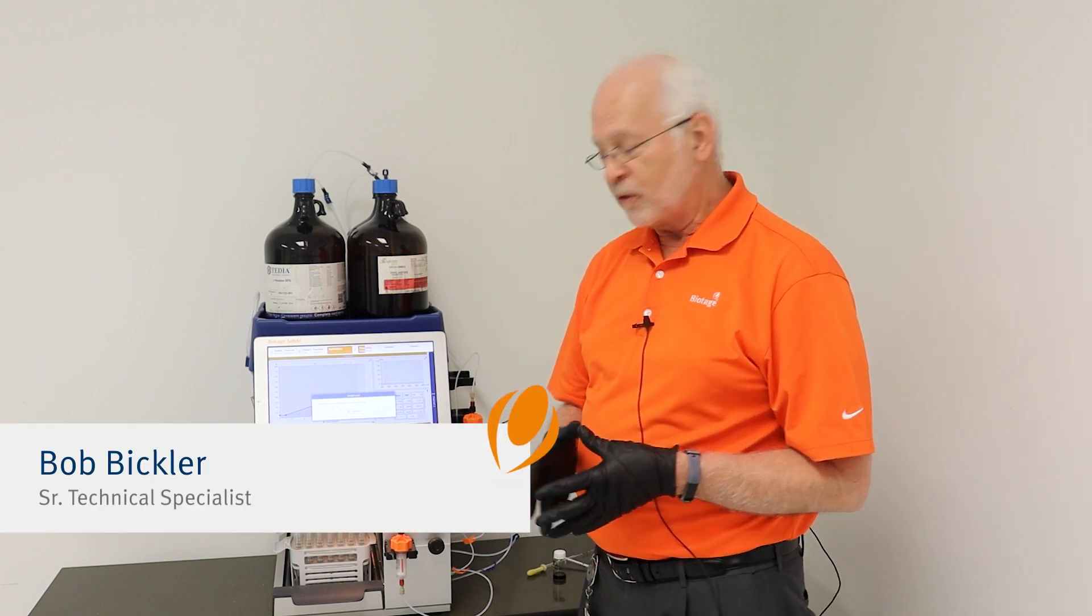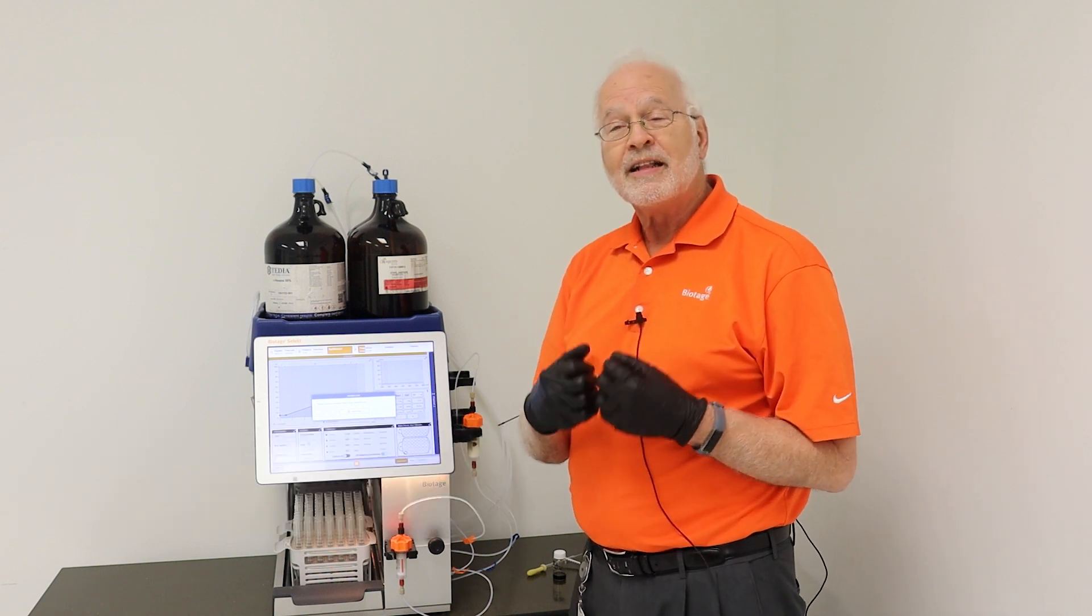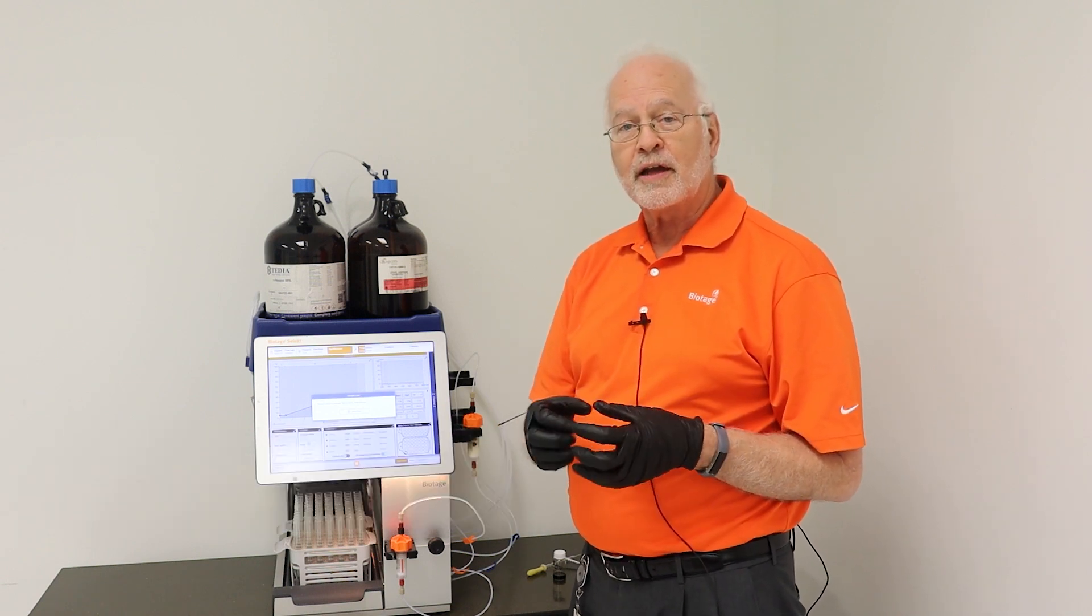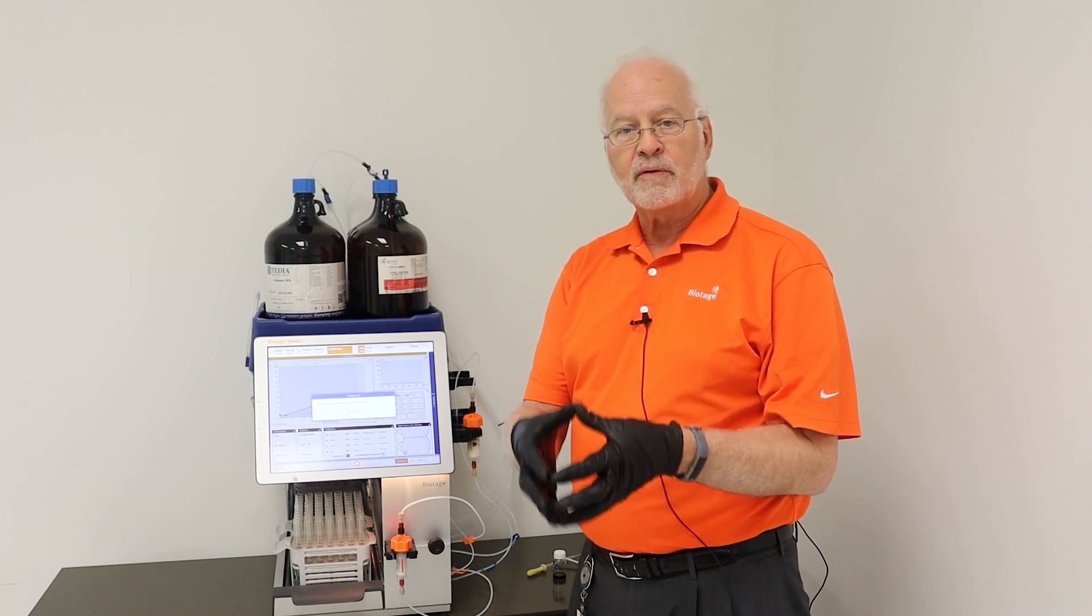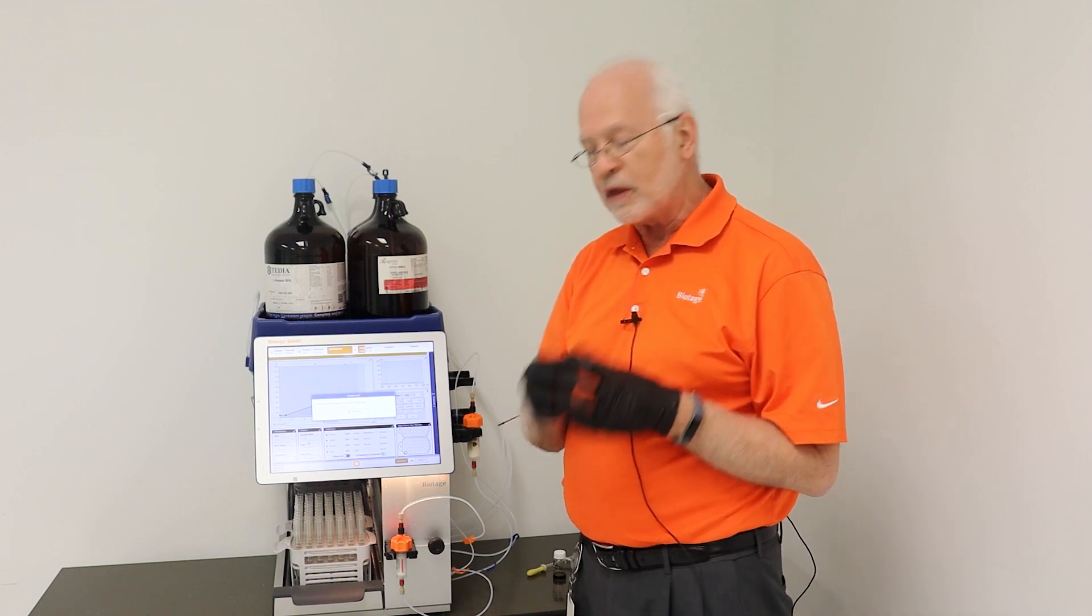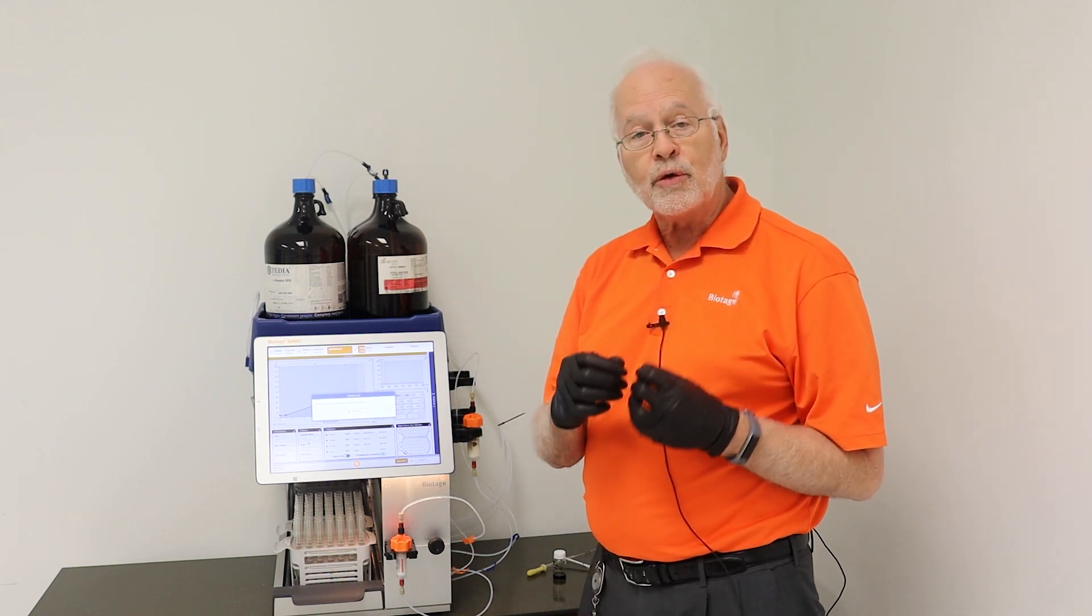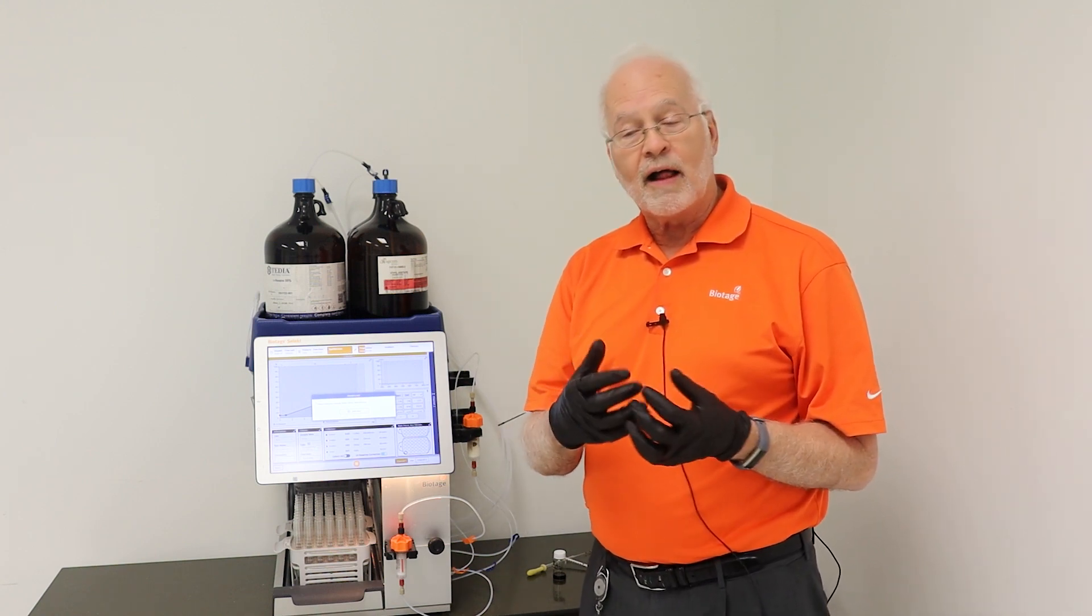Sample loading using a liquid. The third option for injecting your sample if they tend to be on the viscous side or you expect that the sample may not fully soak into the column is to use an injection valve.